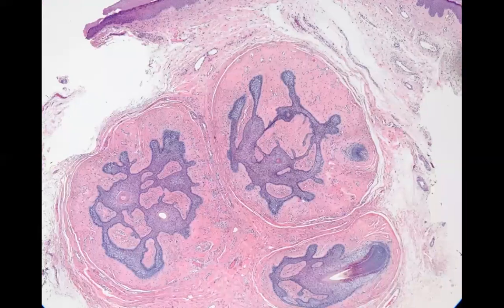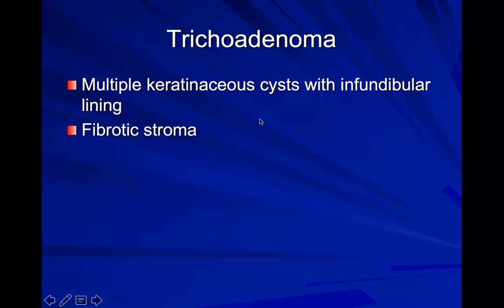This is that same lesion, but turned and cut in a different direction. So here you lose that cystic quality, but you're able to appreciate more how these are follicular structures that are fairly complex. You see all the layers of it down to the matrical portion, including a hair shaft even. Here you have that little horseshoe matrical portion.